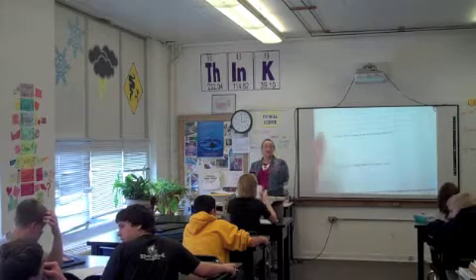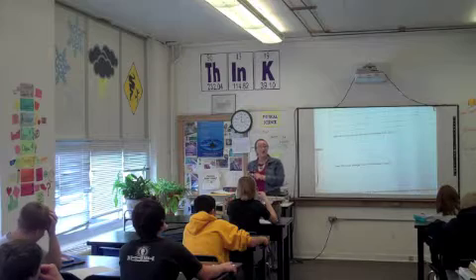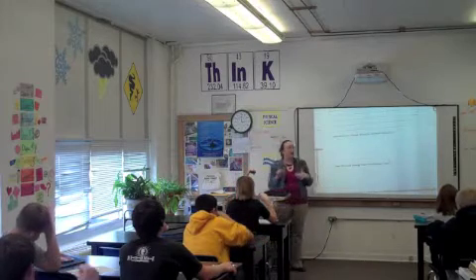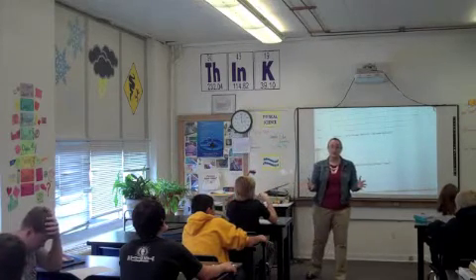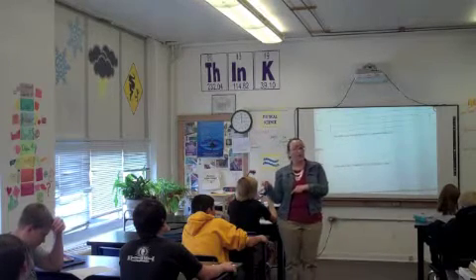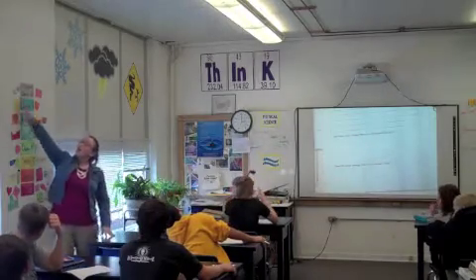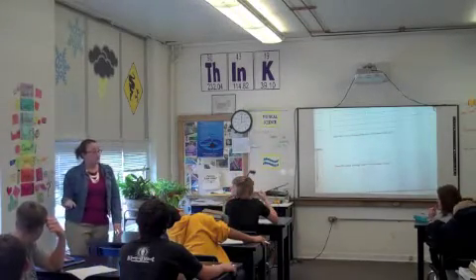Your goal is you are making the color change chart this time. You're going to figure out the trend. You're going to have all these colors from the different chemicals. This time we know the pH. I want you to make one of these charts, so I have colored pencils in the lab for you.